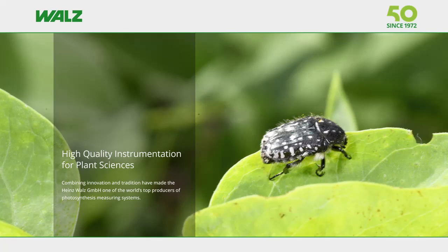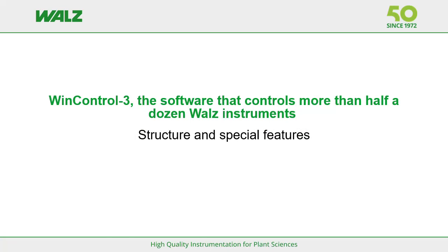Welcome to a new addition to the Walz tutorials. In an earlier tutorial, different aspects of fluorescence measurements were discussed. In the present tutorial, different aspects of WinControl-3 software will be discussed.